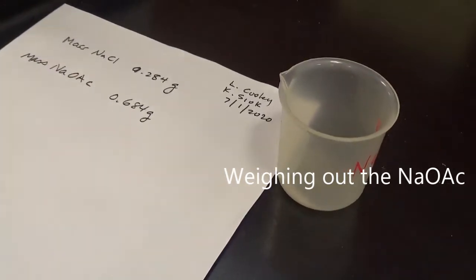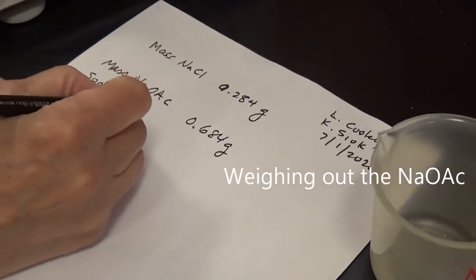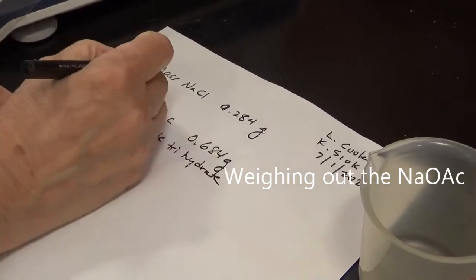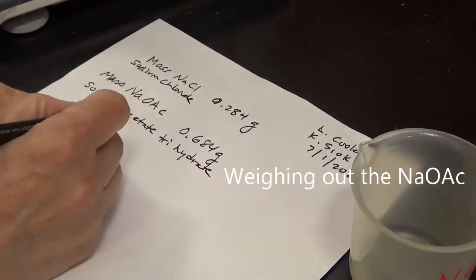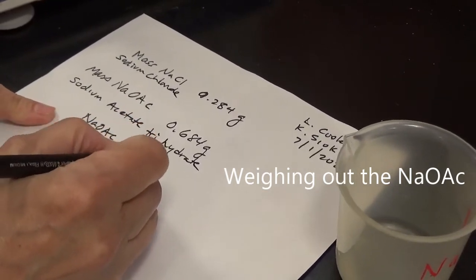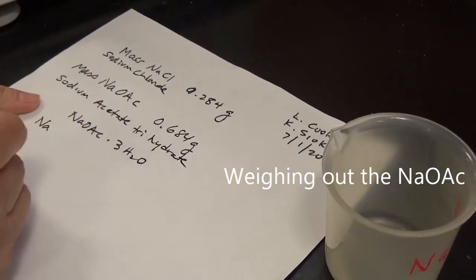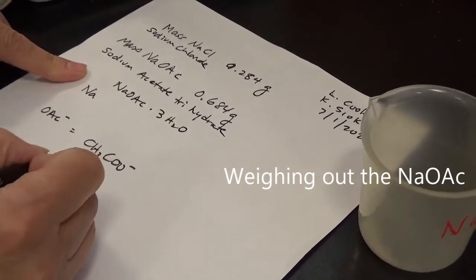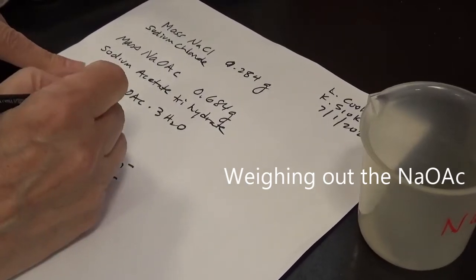And this is actually sodium acetate trihydrate. This is simply sodium chloride. But this is NaOAc·3H2O. If you were going to calculate the molar mass, OAc is CH3COO minus, which is C2H3O2 minus.